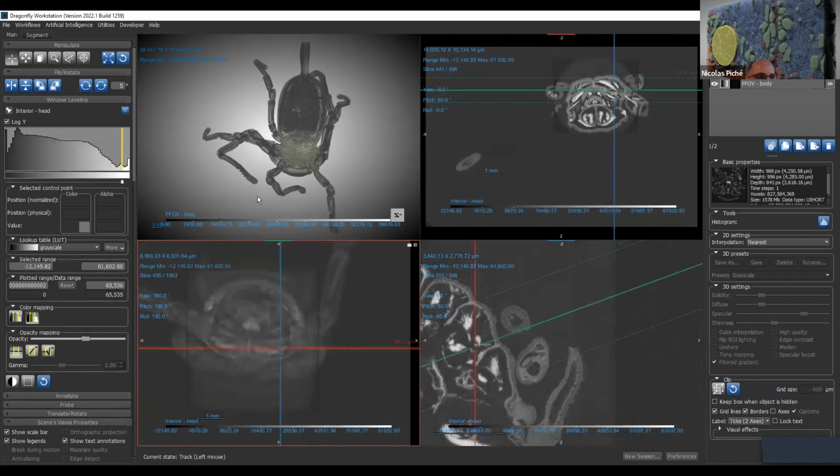When you do that, are you changing the contrast of the thick slab? Well, I'm changing what I'm representing, and I'm working on what has been integrated. Okay, so it's true that it would be fun to have special control on the multiplication or something like that, a function that you could apply directly on the data prior to integration. I will think about it, but it's a good point.